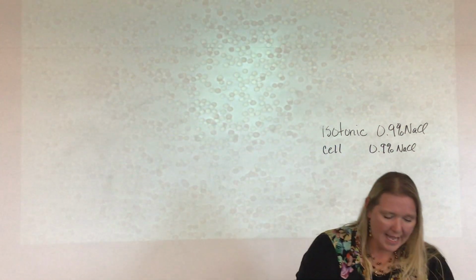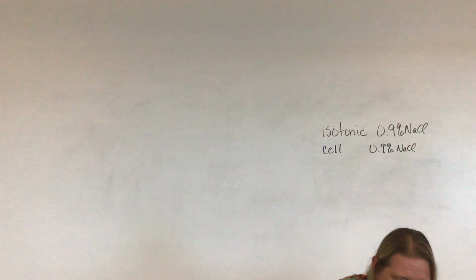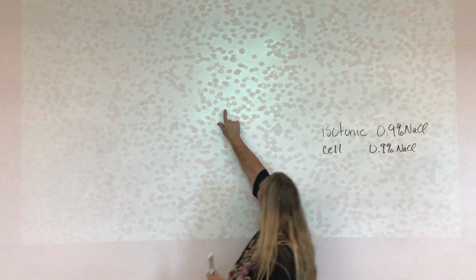So what if I looked at, let me go to lower power so I can move, and we looked at the hypertonic solution. Back to high power. And look at those. I don't know how easy that is to see in the video. Okay. They are a little bit smaller, right? And if we search a little bit, here's one right here, right?